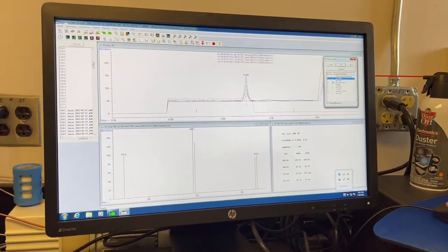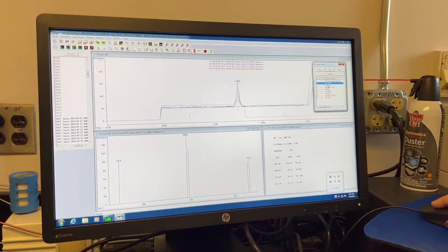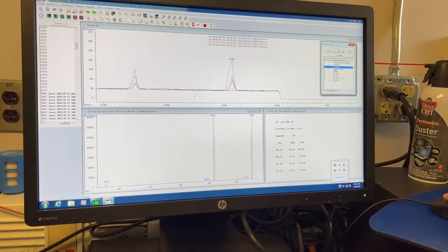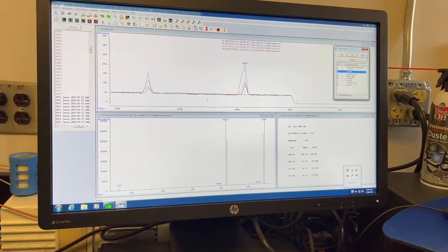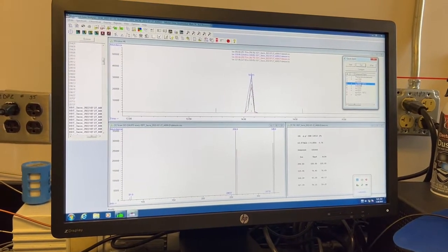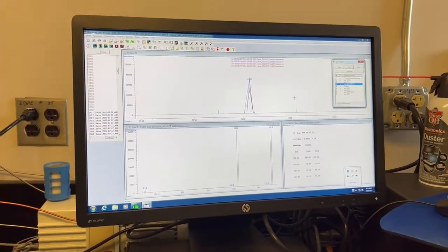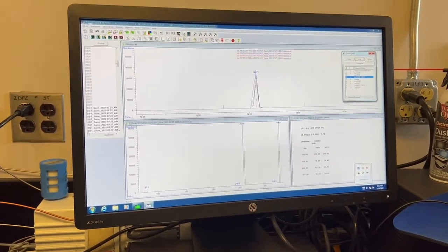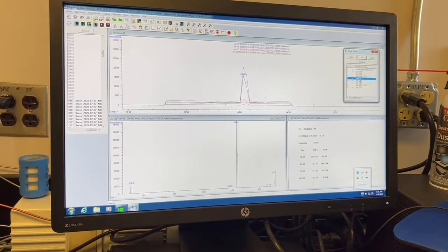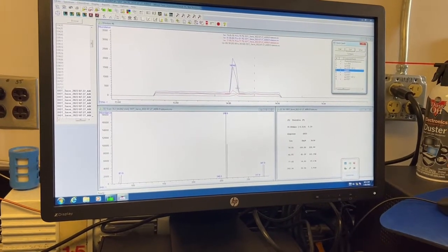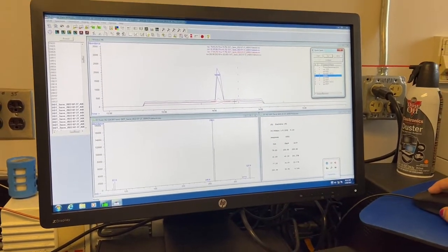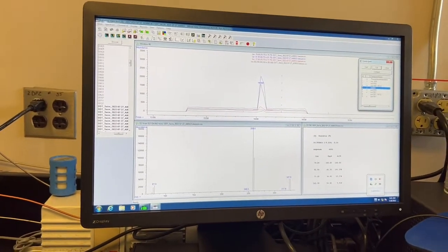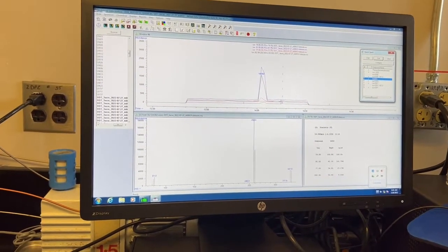So it's there but pretty small. So this one, same with PPDE. So we do see our surrogate. That's good. We wanted to see that. You can see our response to that is big. Dildren. So you can see here it couldn't find a peak right here for Dildren. So it integrated this. But this is not Dildren.